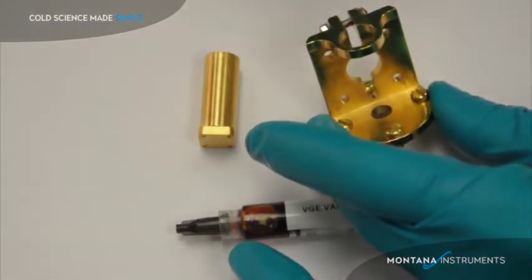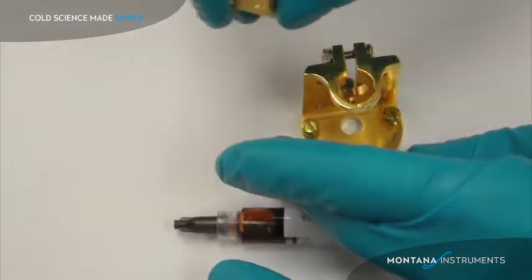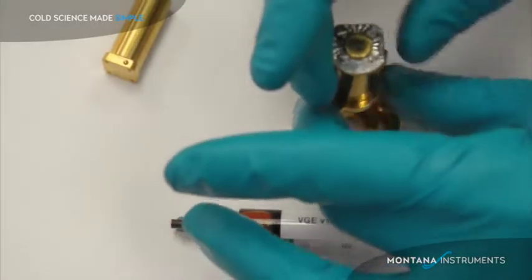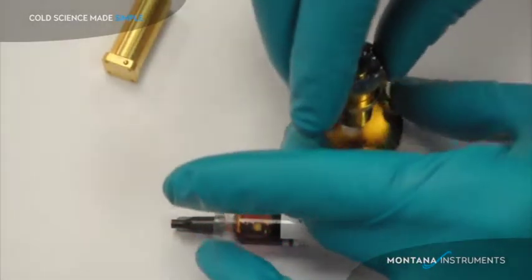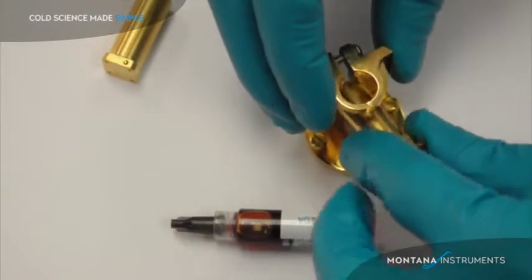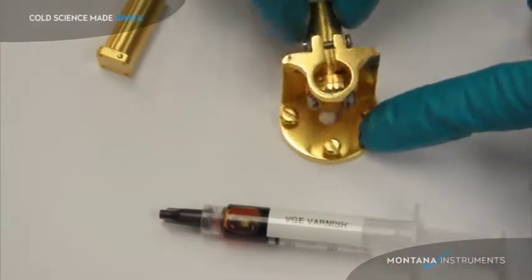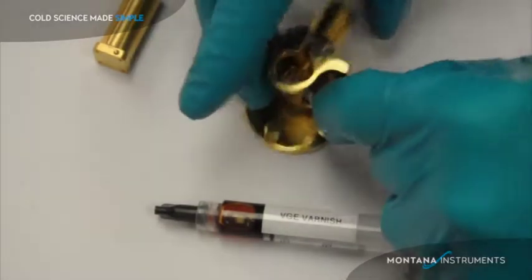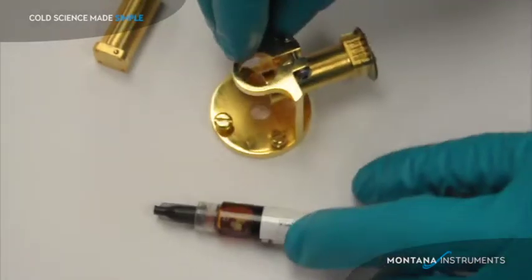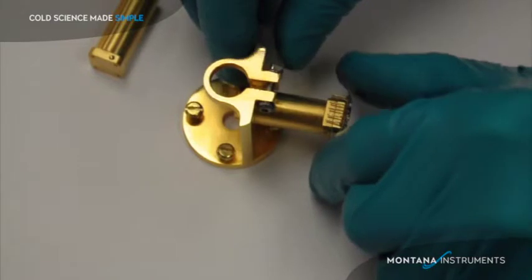This plate or interface would be customized for your sample. The post can be mounted either vertically or horizontally — vertically like such for an overhead view, or horizontally. You can mount it so that your sample is close to the center of the sample chamber, or you can mount it so your sample reaches out so it's very close to the window for low working distance applications.